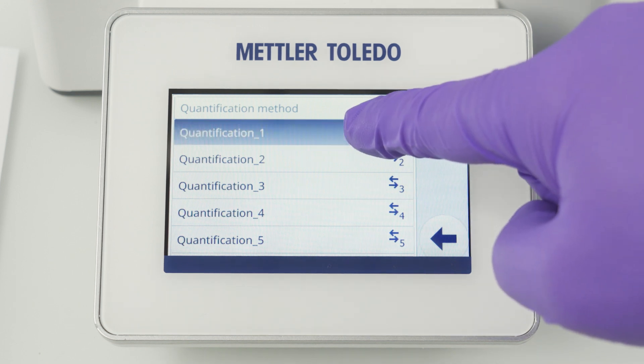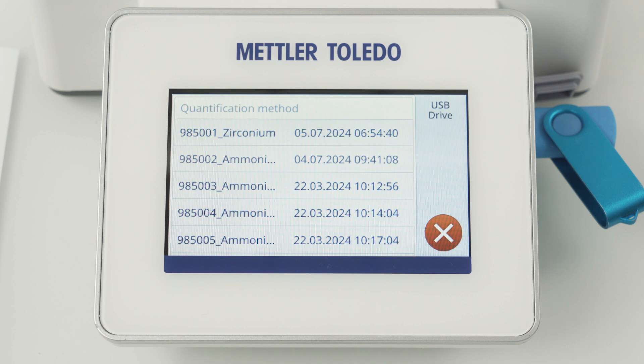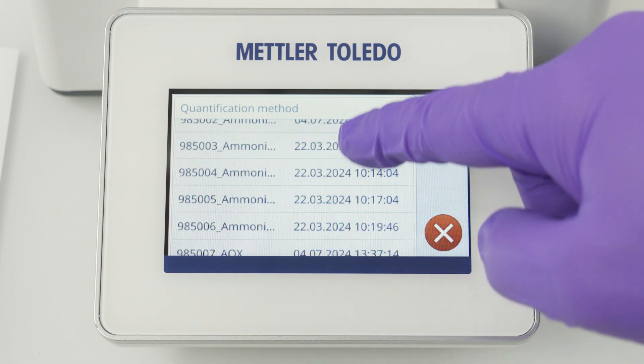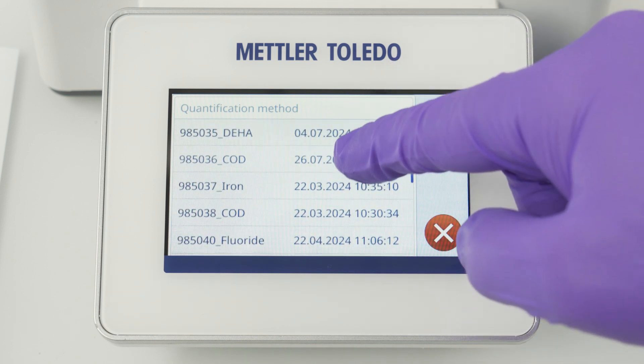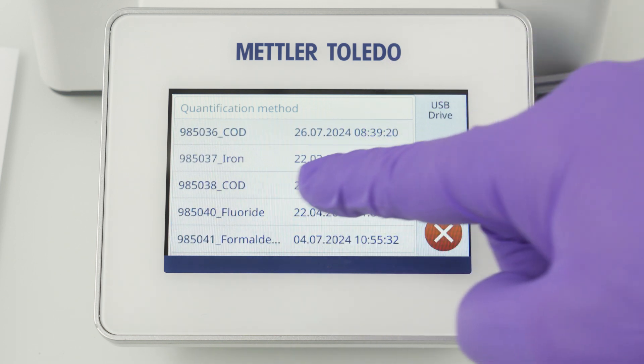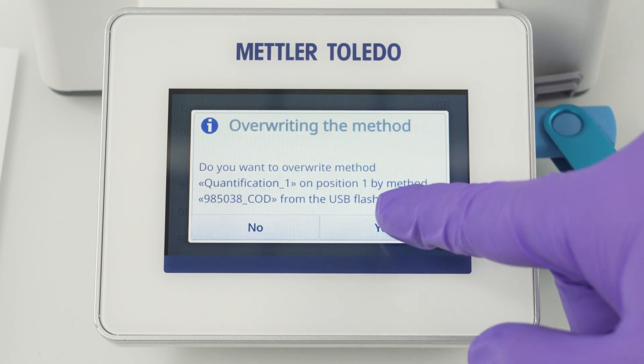Select the method you want to override and you will be presented with a list of all available methods on the USB flash drive. Select the one that corresponds to your test kit. In this example I will import the COD method 985038.